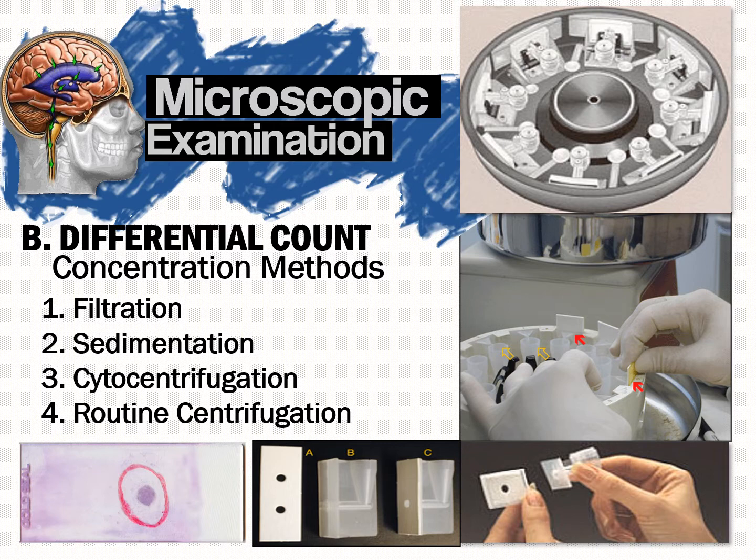So what we have here in the slide are the types of concentration methods. We have filtration and sedimentation. Both have less cellular distortion, better yields of cells, but are not routinely used in the clinical laboratory. What we use is actually cytocentrifuge.